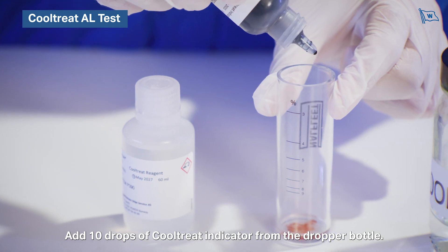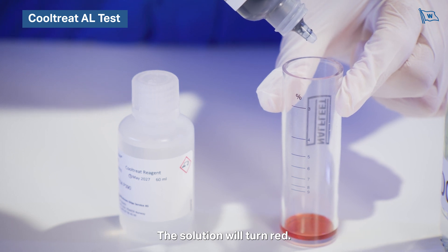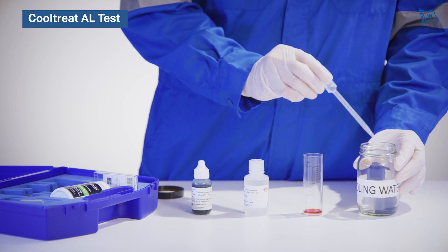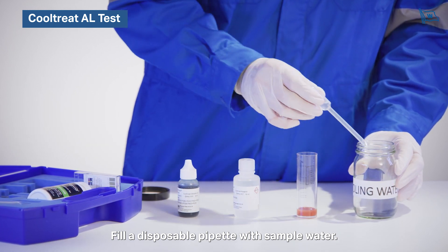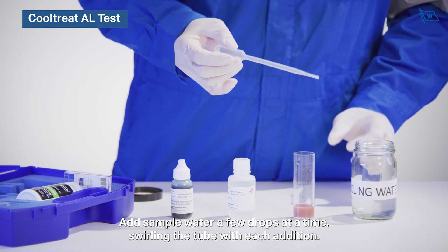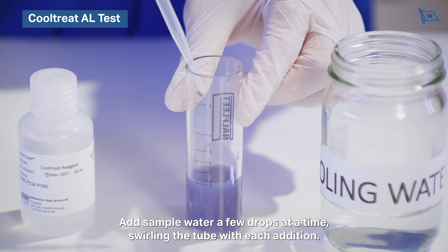Add ten drops of Cooltreat indicator from the dropper bottle — the solution will turn red. Fill a disposable pipette with sample water and add sample water a few drops at a time, swirling the tube with each addition.